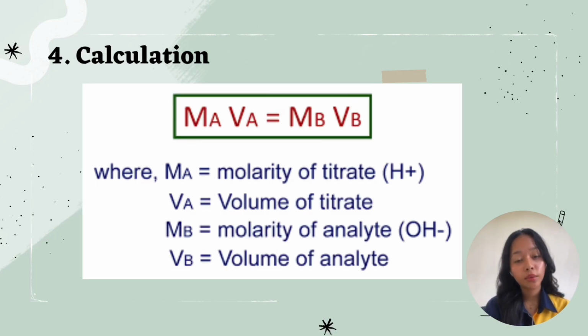Next, calculation. Record the volume of the titrant used to reach the endpoint. Using the known concentration of the titrant and the volume dispensed, calculate the concentration of the analyte using the formula.